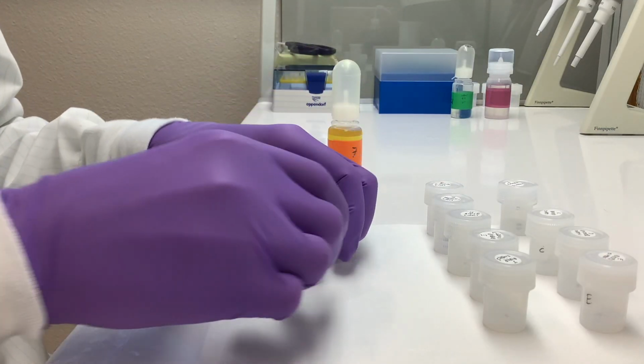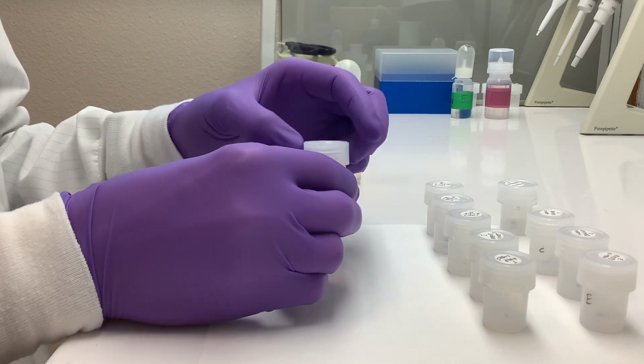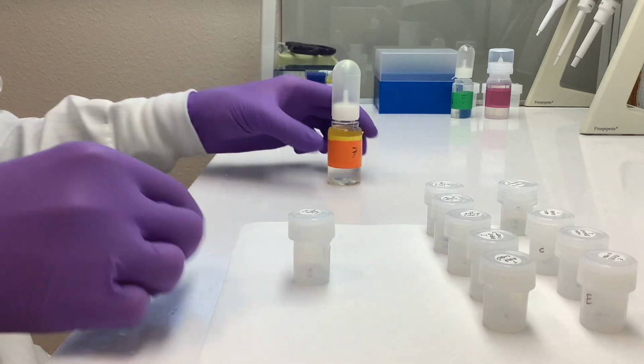After cleaning and rinsing the sample, now I add nitric acid to dissolve the carbonate, as well as a mixed uranium and thorium isotopic tracer.